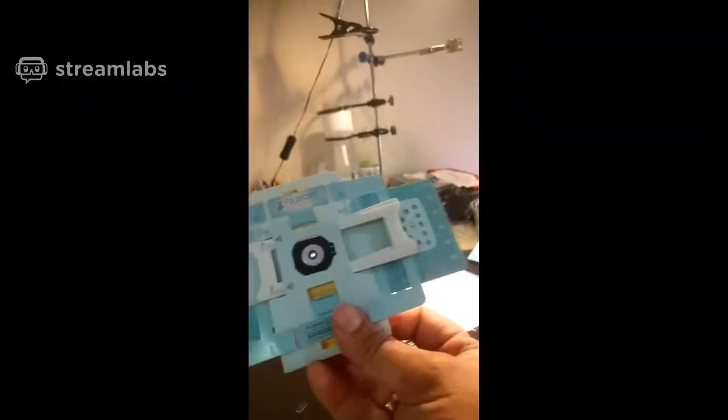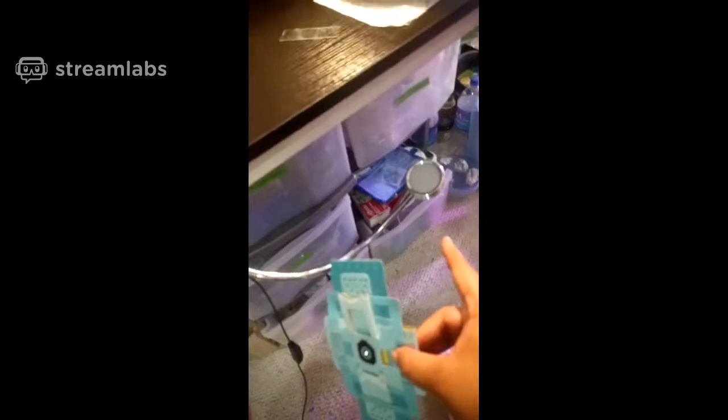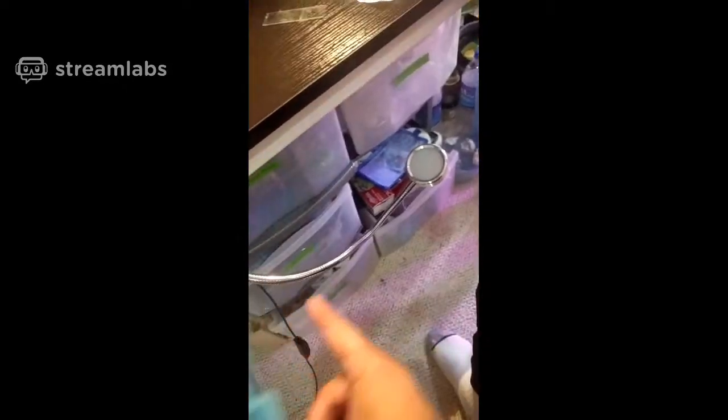Here's my Foldscope. I have a light module. I also have a light that I stick around down here because often I feel that I can get some really good images with this light, which I turn on like this and so on. But today we'll try to see if we can use both of them. All right, so now without much ado, let's get going.